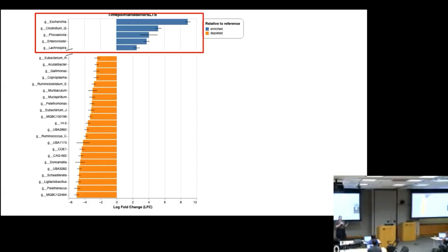So the way that we look at that is alpha diversity, to make sure we have diversity in our 16S. We look at beta diversity to make sure that those features are similar between our donor and our recipient after FMT. And then, like I said, we use this to track specific features after we have identified what's important to us in our study. Does that answer your question?